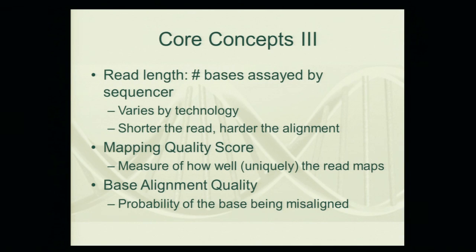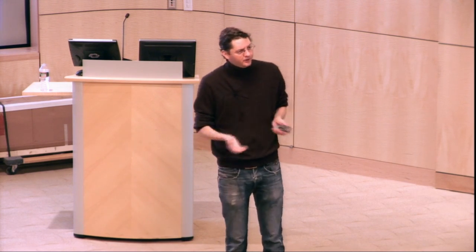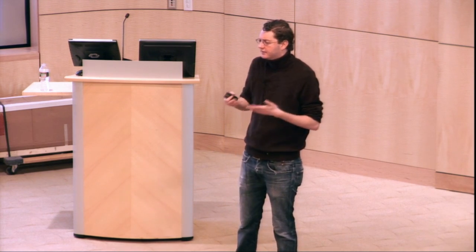Read length is more or less defined technologically based on how long quality persists. So basically, as you push those read lengths longer and longer, you start to get more garbage. And at a certain point, garbage-based data doesn't really help you understand anything about genetic variation. And so it's now effectively a waste of time and money to deal with those sorts of things. So that's really the rate limiter in the read length approach in this day and age.